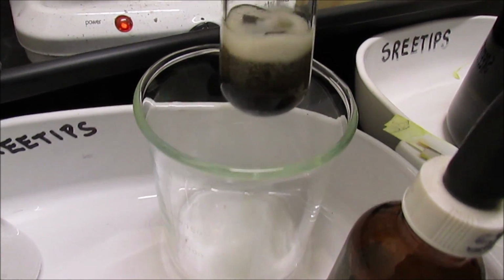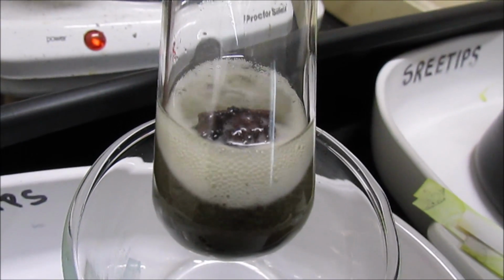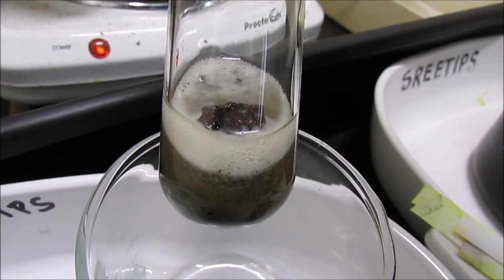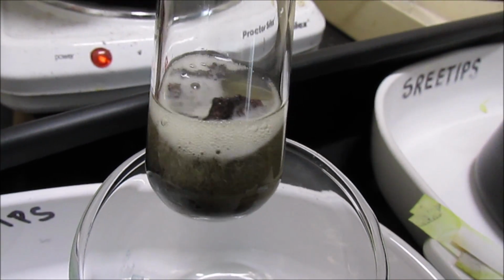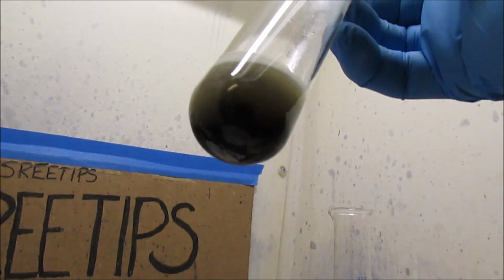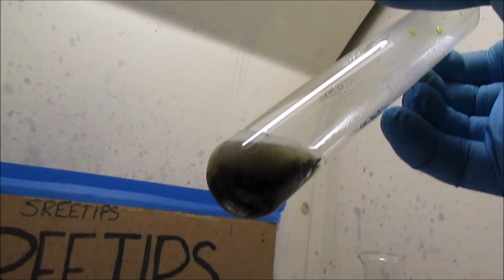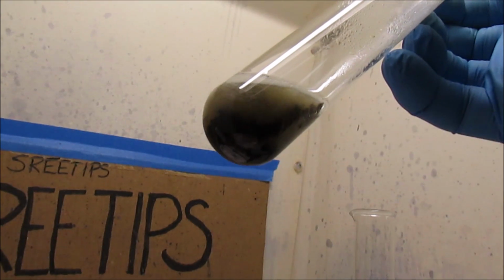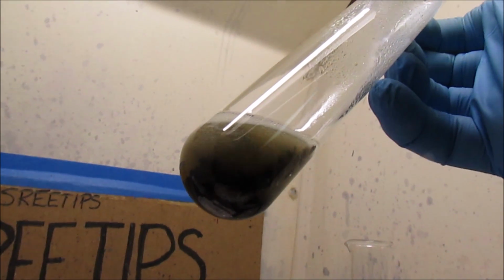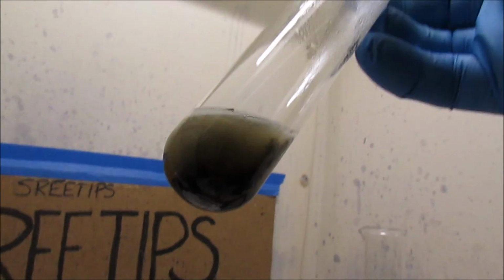And then here I've got zinc. You can see copper coming out of solution on that zinc. I can see red copper metal coming out of solution on that zinc. But it's also bringing the other metals out of solution. Doing it pretty good, the black powder. But this is going to be full of zinc. Or not zinc, it's going to be full of copper along with the precious metals that are coming out of solution there.